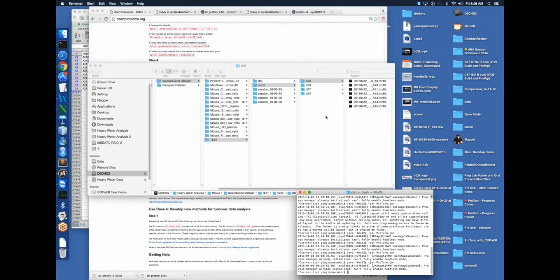I'm not quite sure. Could you give an example of the specific question? Let's say I would like to know if you have the data on a specific knockout mice, and that you have done all the kinetics and all the labeling, and if you have a time course of that, what are the data files that I would have to download for a certain number of organs?